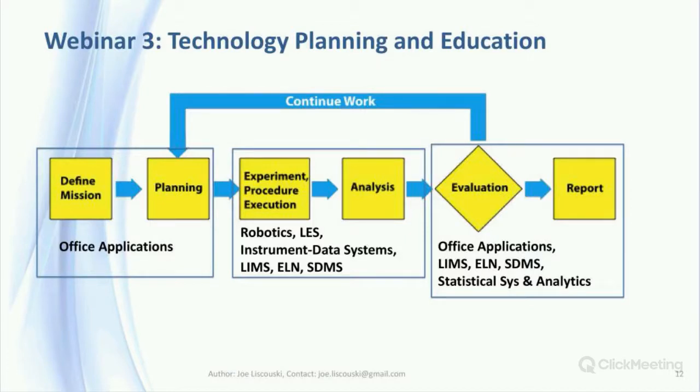Webinar 3 will look at the technology planning and education, and more specifically, how you can gain the benefits expected from your investment in informatics technologies. Effective planning by people with good understanding of lab technologies is one of the key points in successfully applying informatics technologies to lab work. Most failures can be traced back to insufficient planning efforts.